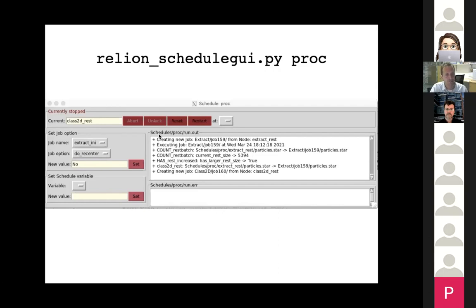So that's a big advantage of the way we did schedules previously in RELION, is you can now abort and restart in a very flexible manner, which hopefully will be useful if you look at these things and realize you've made mistakes. Because previously what many people did, they realized they'd made a mistake, they just start the whole thing from scratch again. That's no longer necessary.